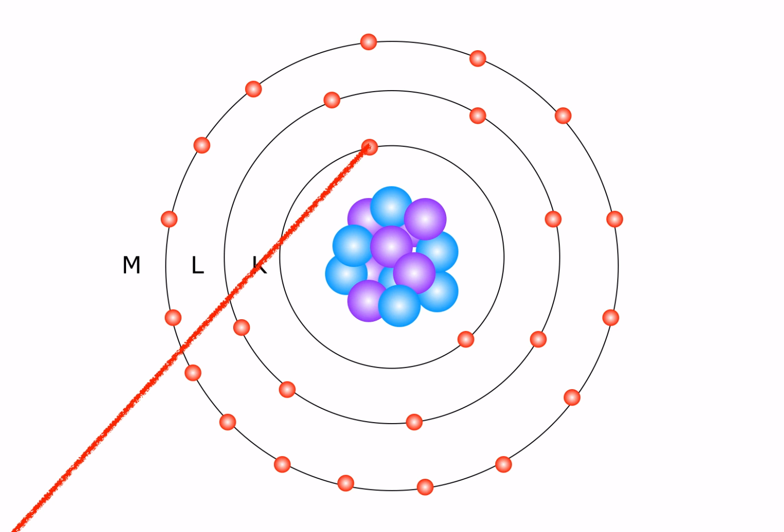And so this is the fundamental reason why X-ray fluorescence is so useful for identifying individual elements in a sample. This is also why X-ray fluorescence is absolutely, utterly useless towards validating whether an element is in one molecule or another, because the outer electron orbitals don't matter in this transition. It's only the internal electronic structure that we interact with.